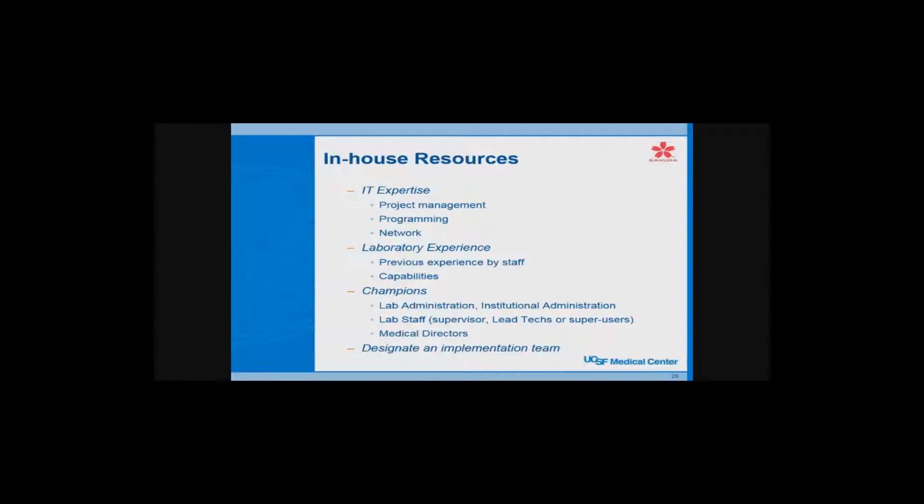But some in-house resources, IT expertise, they have expertise in everything from project management to programming. Our IT department doesn't do programming. Some institutions do have that capability, but ours does a lot of installing of networks. Laboratory experience: does your staff have experience in barcoding somewhere else, or done something like that somewhere else? It may be a different type of job, but do they have experience in this kind of system or projects?